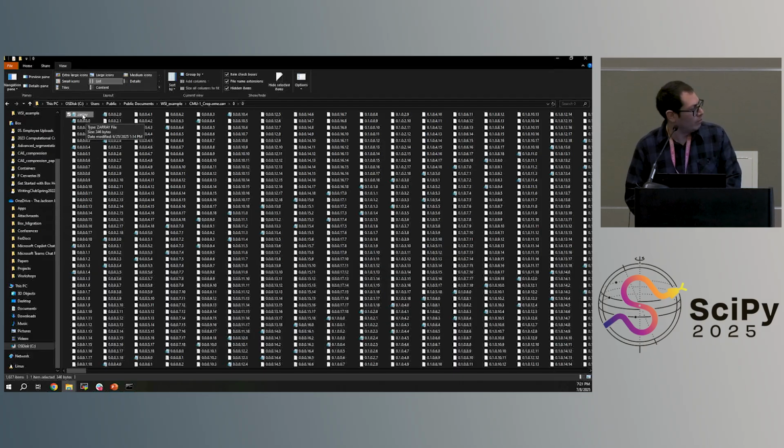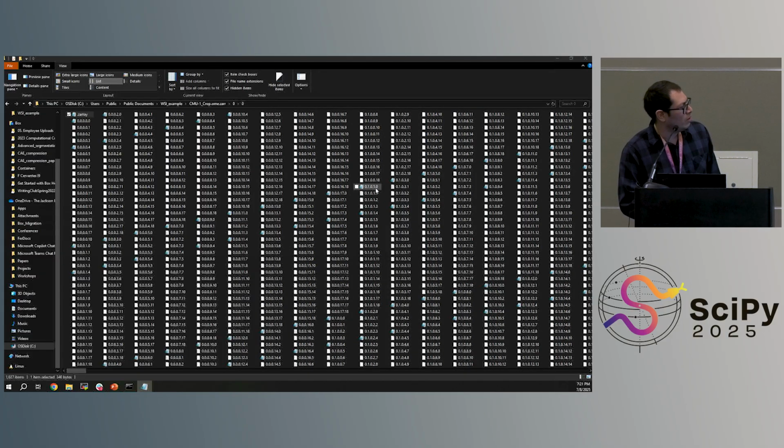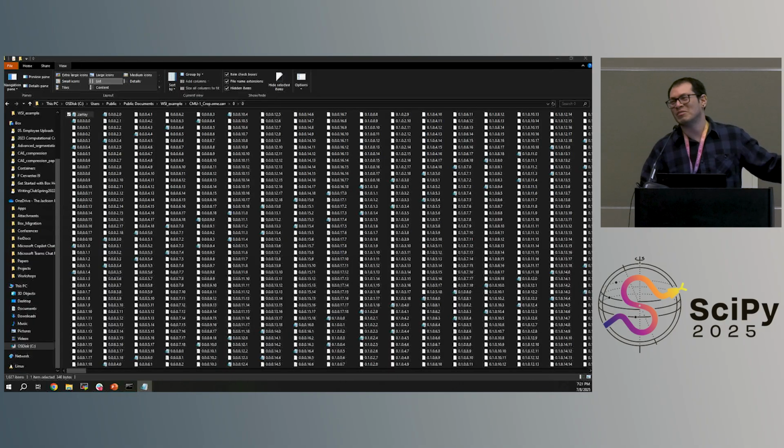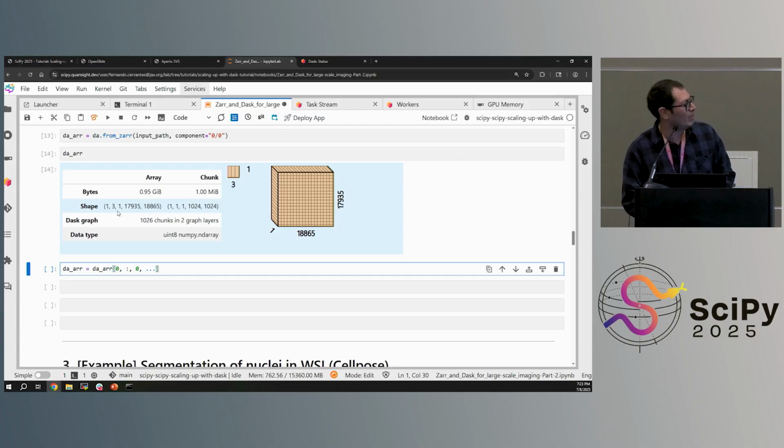DA gray. Yeah, I probably took an empty space there. So I would probably just select another chunk. I can see a little bit in the corner. Oh yes, some dust or something in the corner there. So I'm going to use the color map gray to make it actually show. Yeah, well, there is something.